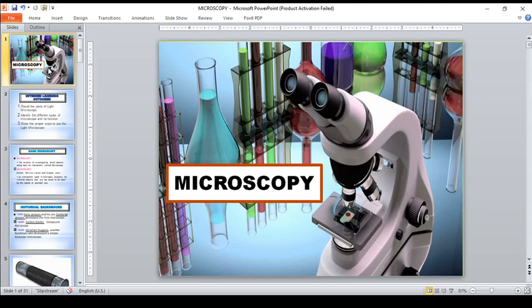Take note na nasa 45,000 up to 100,000 depending on the brand of the microscope that you intend to buy. Unless later on you want to become a pathologist, then why not? Diba? Pwede naman. But again, I am not requiring you to buy a microscope.